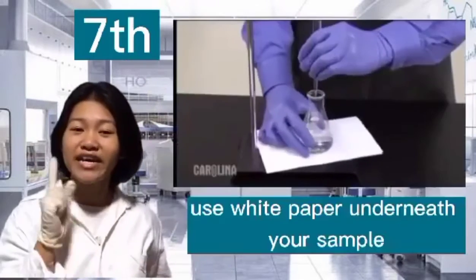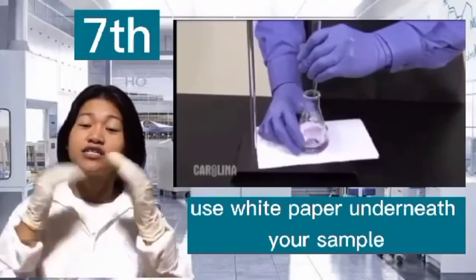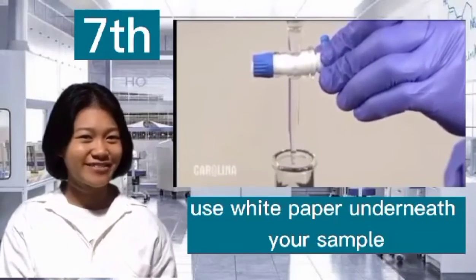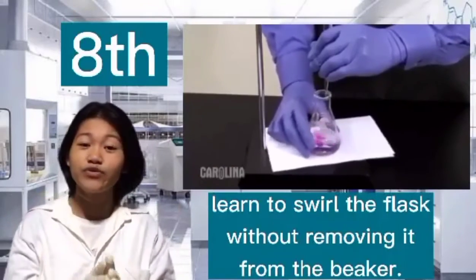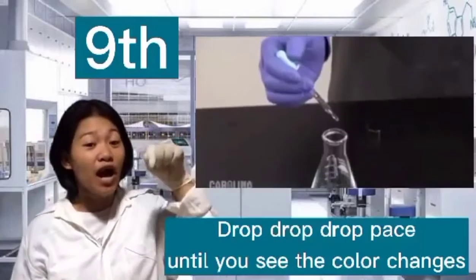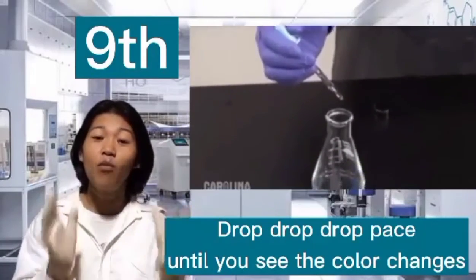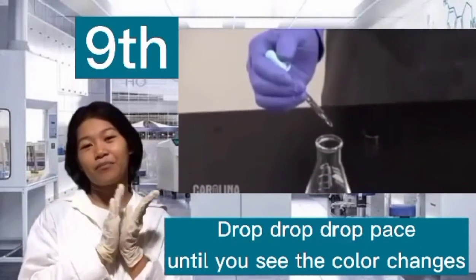Seventh, always use white paper underneath your sample flask so that you will notice slight color changes. Eighth, learn to swirl the flask without removing it from underneath the burette. Ninth, use a drop, drop, drop pace until you see the color change becoming more than local. It is where the titrant meets the sample.